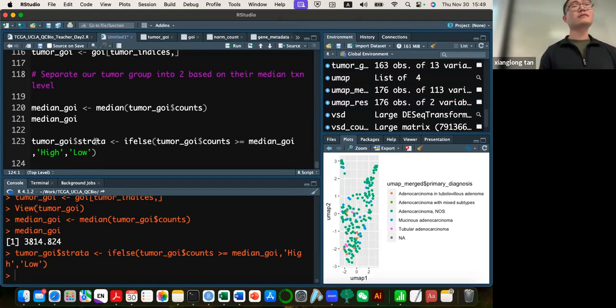Make this a factor. I don't think it's a factor, right? You check that. No, we don't have to.